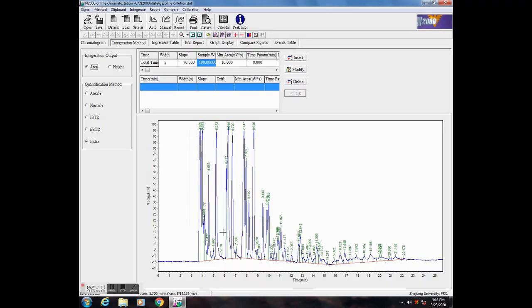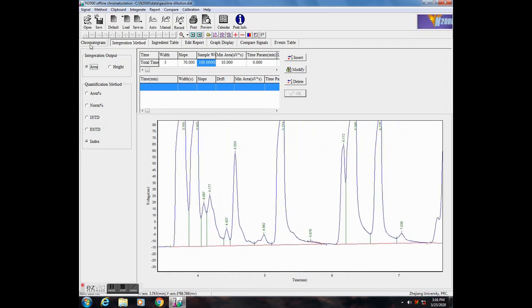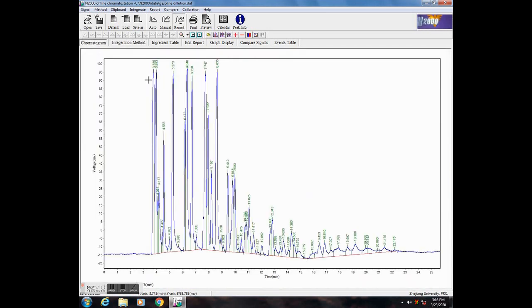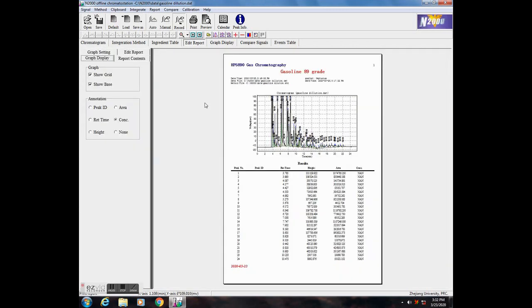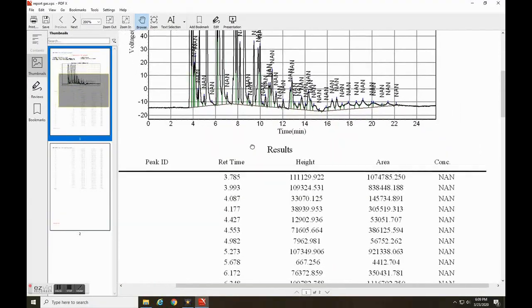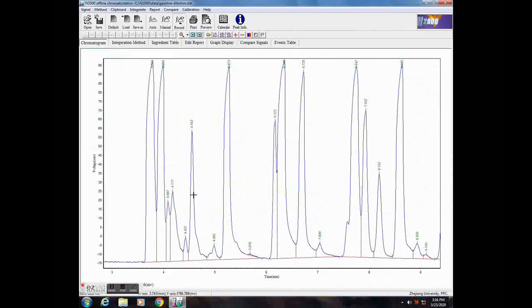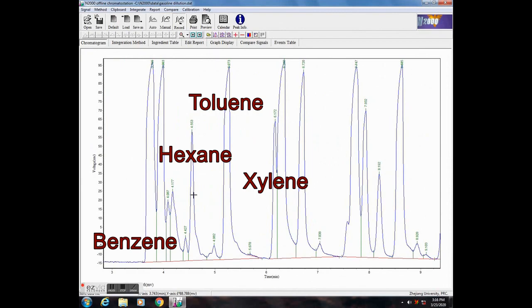This has to be studied further, as my detector can only reveal UV absorbance at a specific wavelength, and operating conditions and detector response can vary greatly from one setup to another. But I can estimate the position of a few alkanes and get a pretty good idea of the major components. Based on previous tests, I can identify hexane, benzene, toluene, and xylene in this gasoline sample.